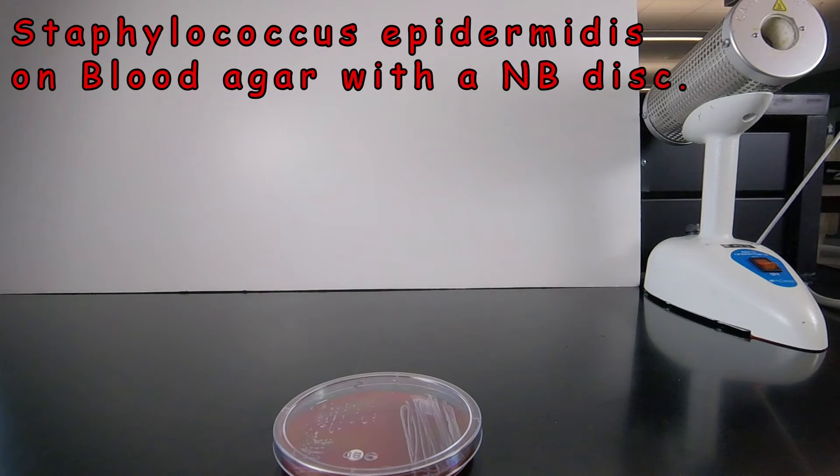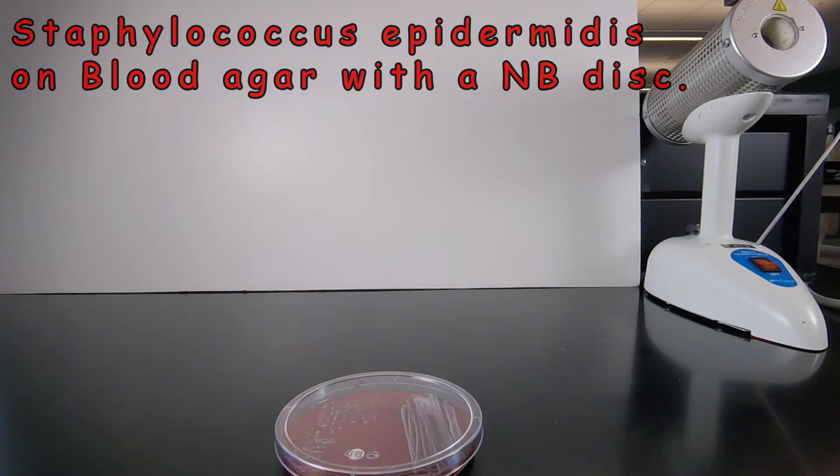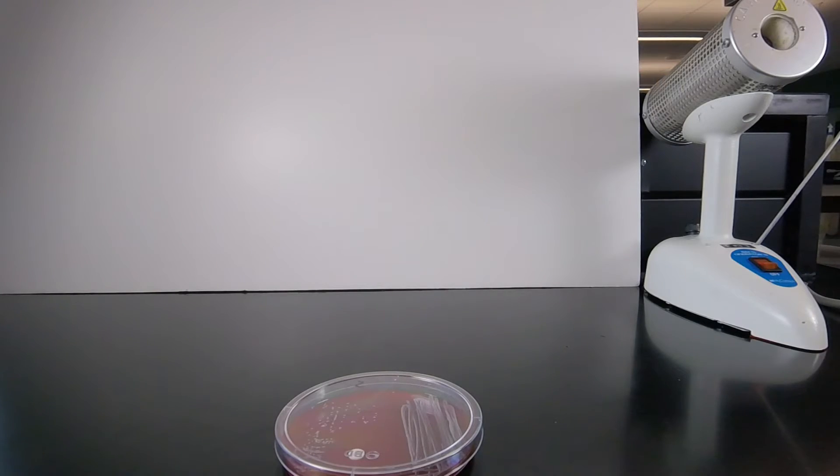This is another of our two unknowns in our Staphylococcus lab that was streaked on blood agar, where we placed a novobiocin disc on the plate. Let's take a look at the results of this one.